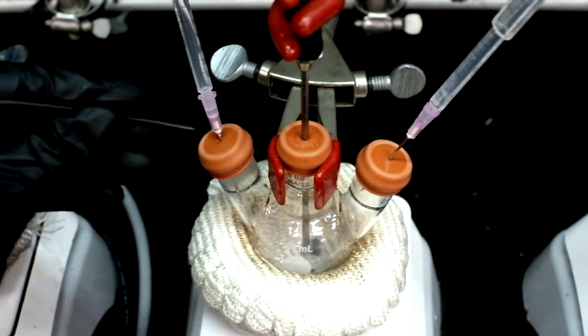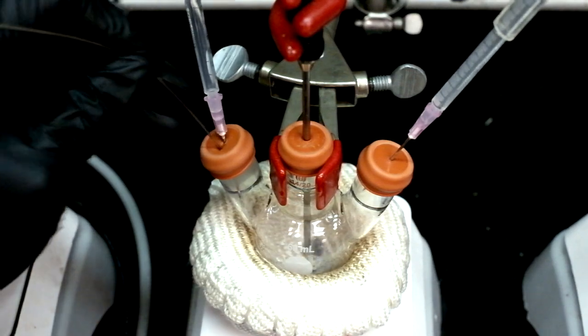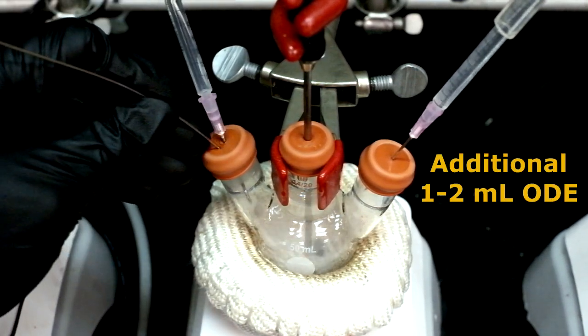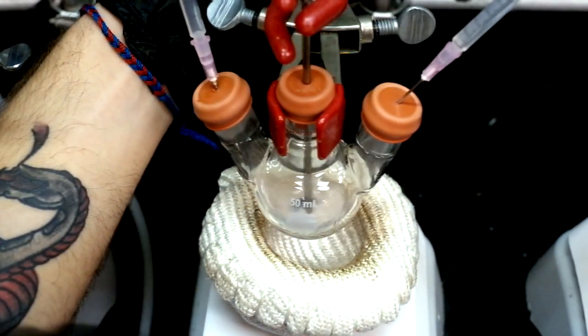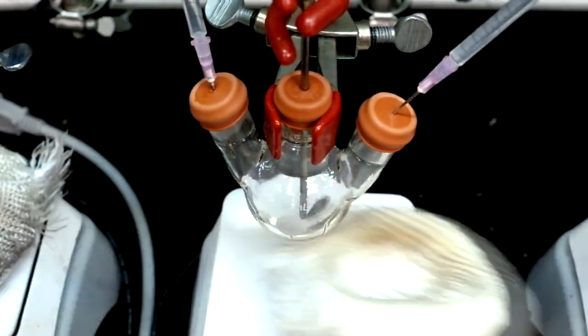If you notice your solvent evaporating during the heating process for the cadmium flask, you can add one to two milliliters of ODE. Once the cadmium solution has become optically clear and colorless, you can take it off of the heating mantle and let it cool to room temperature.